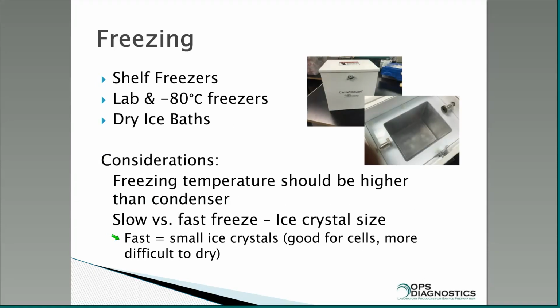So for the freezing, there's two ways to freeze. Either you can do it by hand, or in, let's say, a dry ice ethanol bath for an ampoule. Over here in the images, we have something called a cryo cooler, which is a device we make for storing things at liquid nitrogen temperatures. There's a well right here, and in this well we put liquid nitrogen.